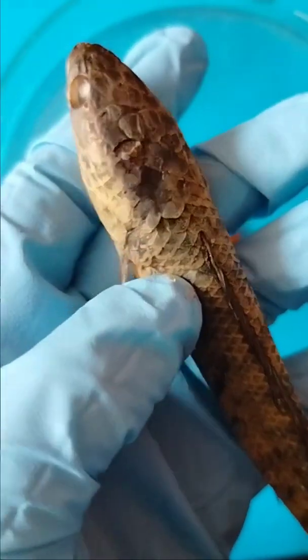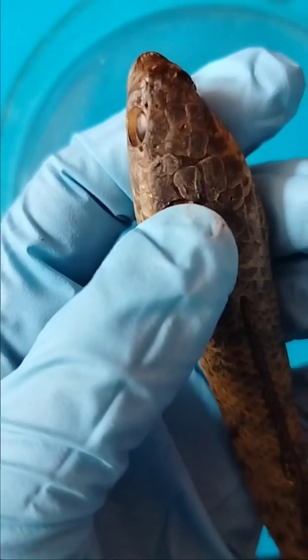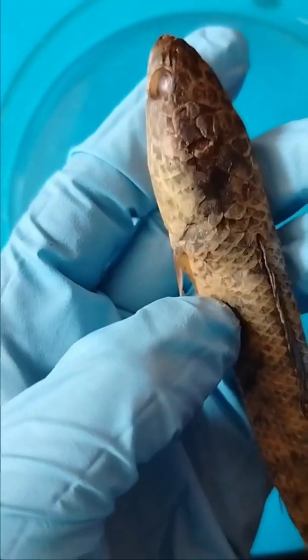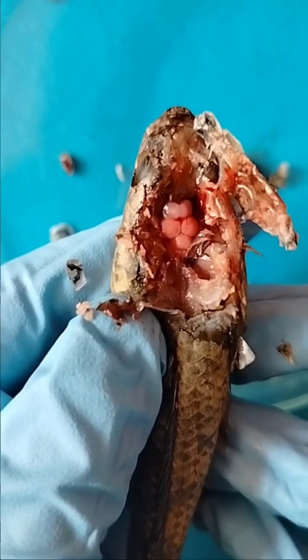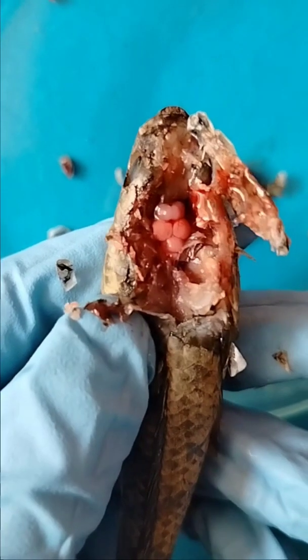This optic lobe is connected with the cerebellum, also known as the little brain of the body, and anteriorly it is connected with the cerebrum. The last part is the myelencephalon. It is the posterior part of the brain which goes towards the abdomen through the spinal cord.